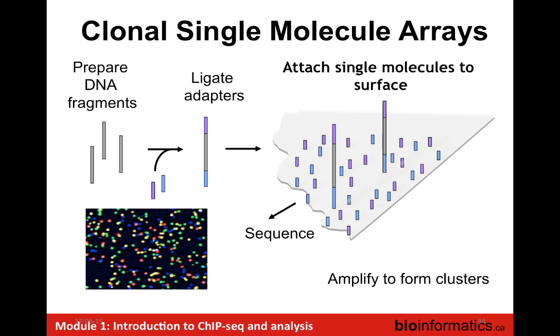Typically, it's done in solution, but you're on the right track. You're right that the sequencing itself is done in microwells, for example, in the 454 or the Ion Torrent system, which was Life and now is, I guess, Fisher. But how is that clonal amplification done? Who knows? Not done on a flow cell surface. It's done, SOLiD sequencing. Anyone remember that? Same idea, right? It's done on a bead.